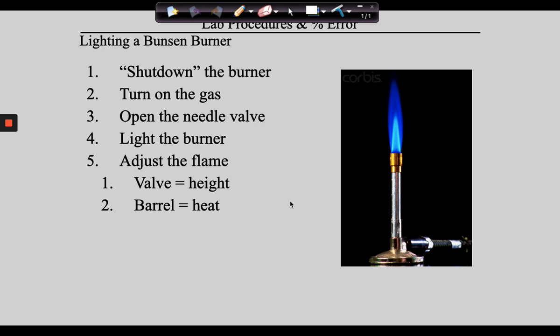You're going to set this Bunsen burner on there. And then you're going to adjust this until the ring is level with the hottest part of the flame. If you don't do that right away, then that ring and everything else there that's metal is going to heat up. Not enough to boil water, but enough to burn you. Even this little set screw back here. And if you let this sit for a couple minutes, you're going to find that you can't adjust it because it's just too hot. So guys, adjust it immediately. Set it up like that. That is what a well-adjusted and set up Bunsen burner ring stand looks like.